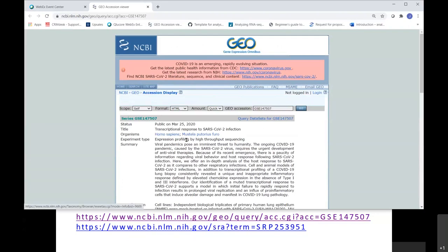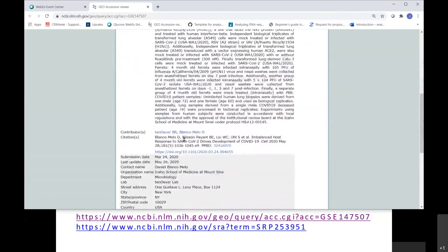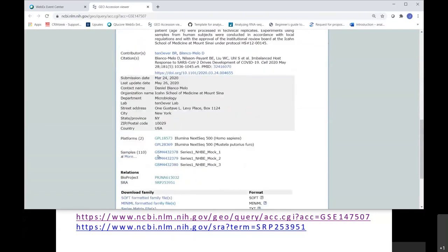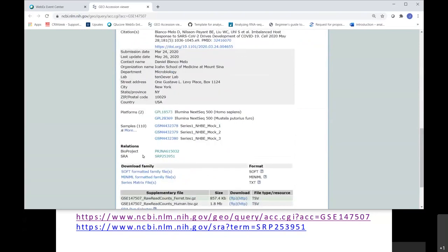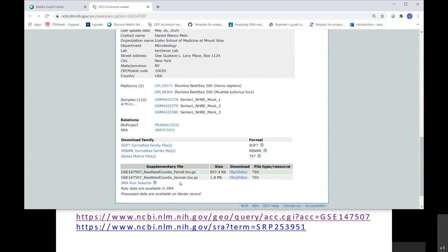Now I'm at Gene Expression Omnibus. We can see this was published in March 2020, and here we have more information about it — the two platforms and information about the samples. You can see the BioProject identifier and click on the SRA identifier for the project. In this case we also have two supplementary files you can download — raw read counts. In some cases you have this type of raw read counts; in other cases you may have 10x files. But in this webinar we'll focus on the raw FASTQ files in the SRA.